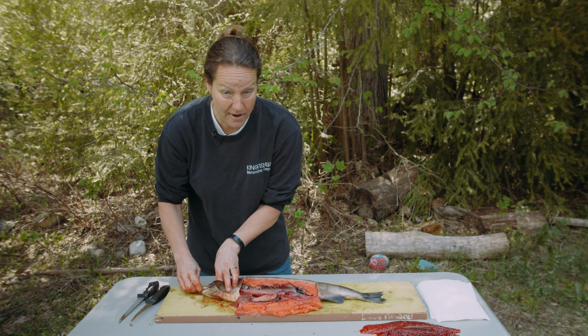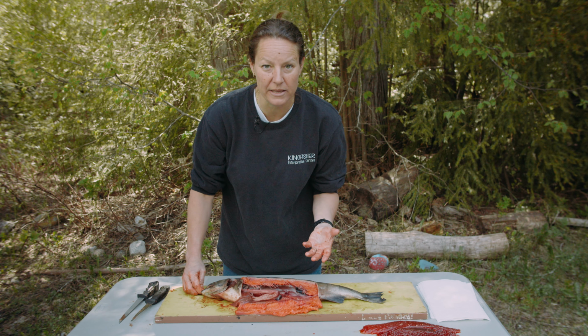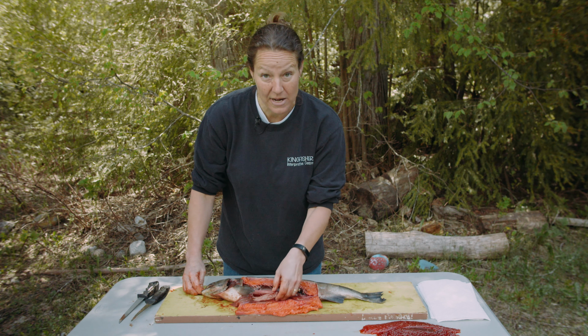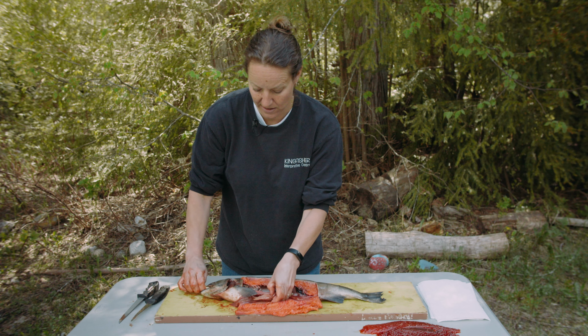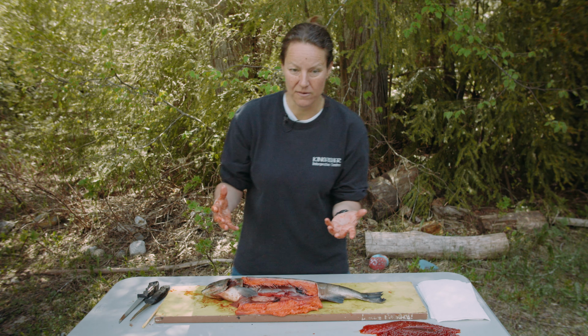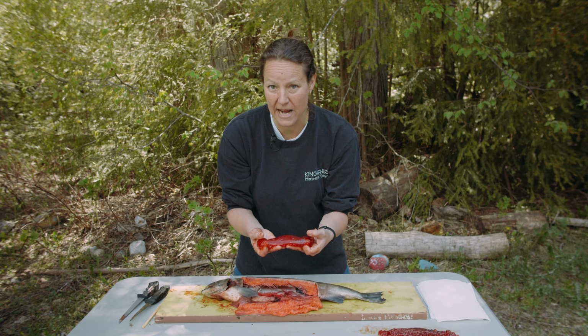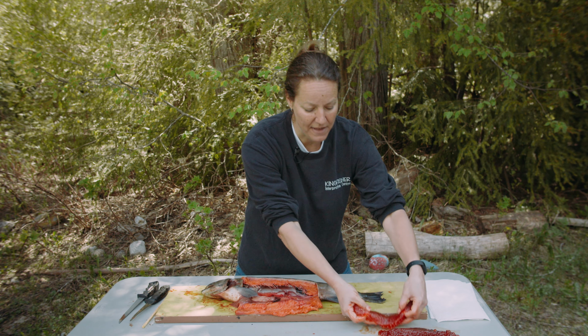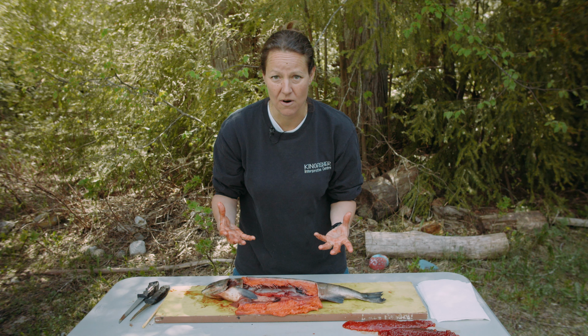So what I find really interesting is that that stomach is empty. There's no food in the stomach. And what we know about salmon is that when they leave the ocean, they stop eating. Why do they stop eating? Well, I think part of the reason is because we saw how much room these eggs take up inside the fish. If that stomach was full of food, there wouldn't be room for eggs to grow or the milt to grow.